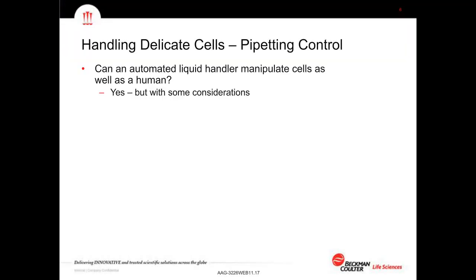So the question is, can an automated liquid handler manipulate cells as well as a human? And the answer is actually yes. Often people think no, but the answer is yes, with some particular considerations. And it's very common that when we automate a process, you do have to tweak some things.